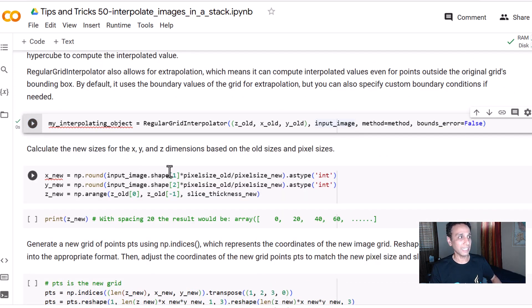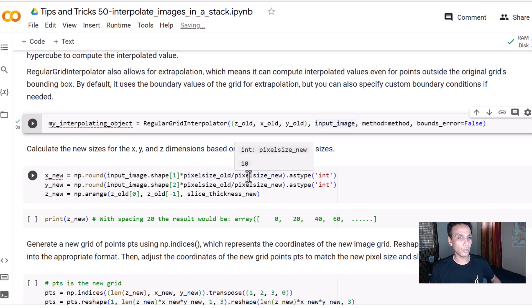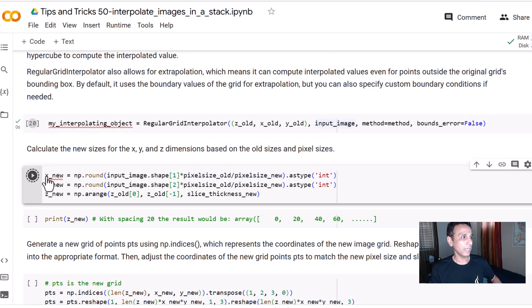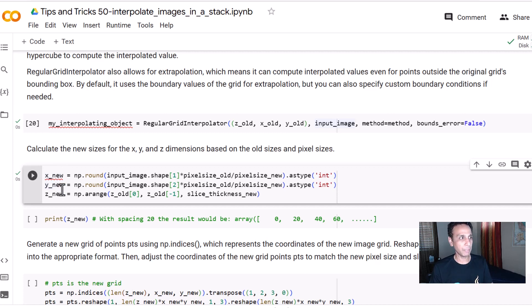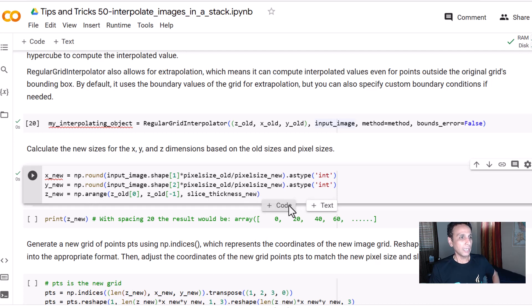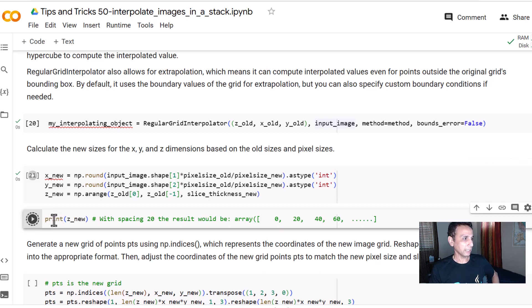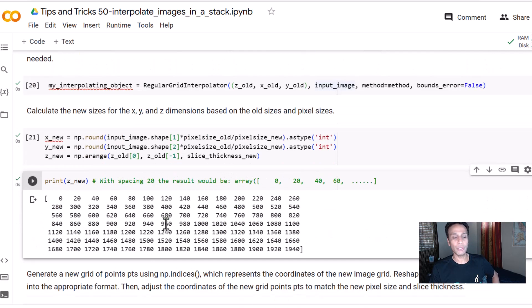Now we create the new coordinate arrays. x_new and y_new are the same as before since we're keeping the same 10-nanometer pixel size. Only z_new changes — it takes the new slice thickness and fills in those coordinates. Previously the z values went 0, 40, 80; now we have 0, 20, 40.